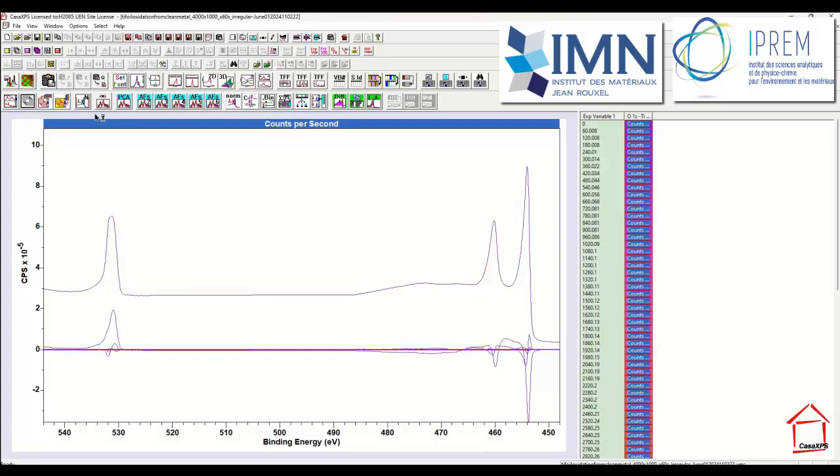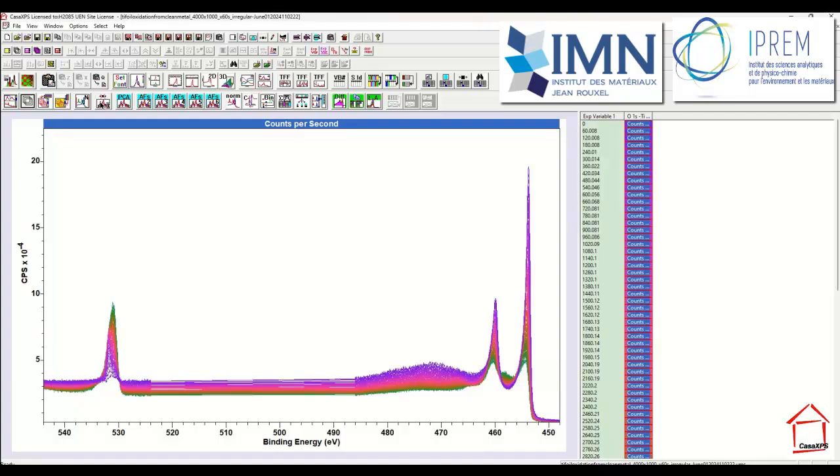So I need to reconsider which part of this experiment I'm going to apply the techniques that I'm about to illustrate. So the idea is to find a part of this experiment where the variation is occurring, but it's only occurring by two spectra combining to form these variations. In other words, a two-dimensional space.